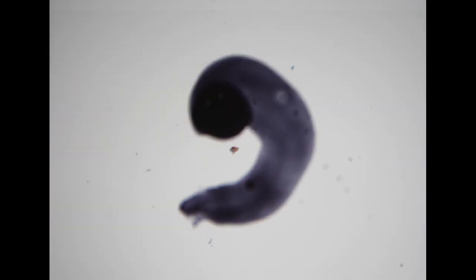Supposedly she might have suppressed immunity, and thus it's easier to have an HPV flare-up, which may cause a precursor CIN lesion in the cervix, and the cells might shed in the urine cytology specimen. Just like what we saw maybe yesterday or two days ago, there's another specimen. For this type of specimen, we will call these atypical. We see atypical squamous cells, and we suggest the patient do a pap smear.